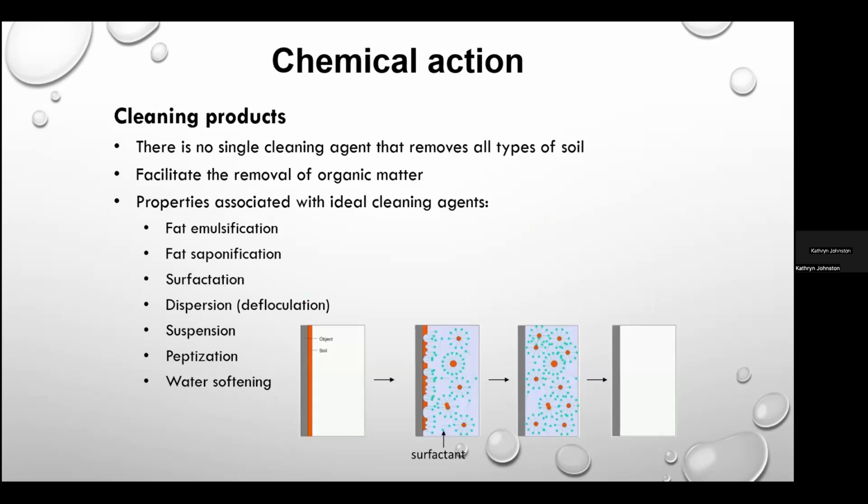So when you talk about cleaning, there is first of all a chemical action, and when you talk about the selection of that agent to use, you have to look at what type of organic and inorganic material you're having to clean off of the surface of whatever you're cleaning. And so you have to look at each of these different components to see what is going to be most effective.